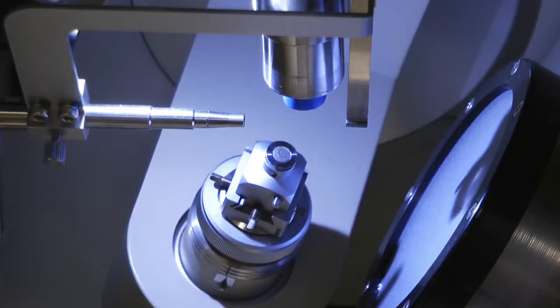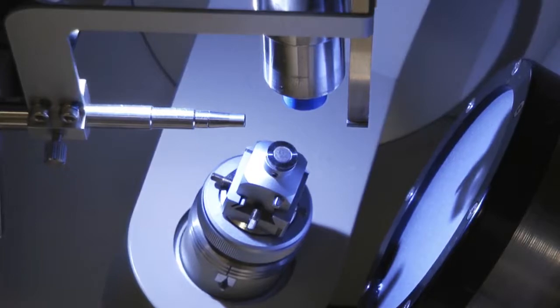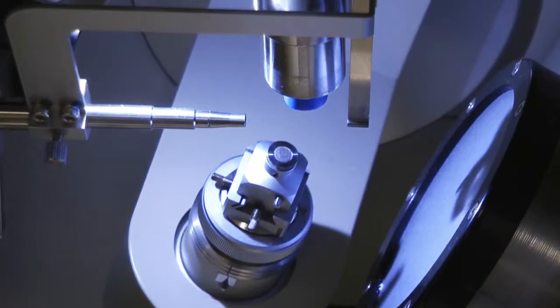It is a good idea to conduct an experiment at low temperatures, as this keeps the crystal stable and lowers the thermal motion of the atoms within the crystal lattice. Therefore, we have this low-temperature device.